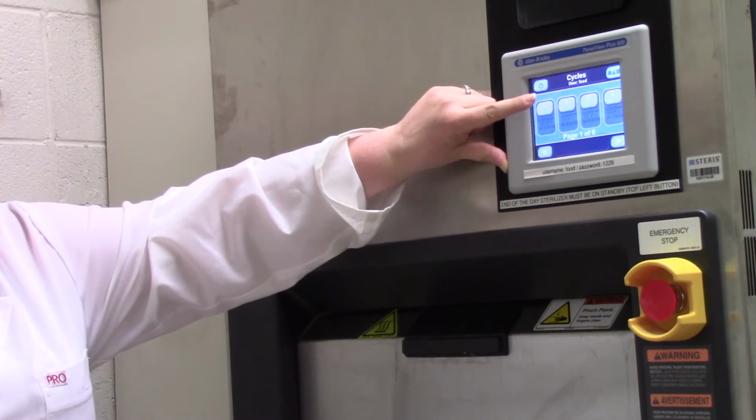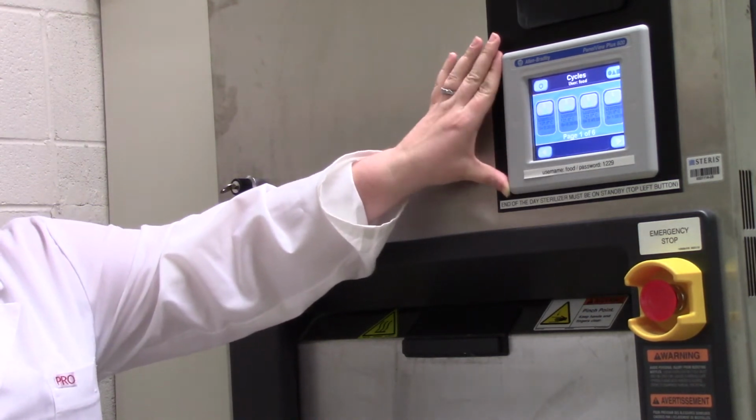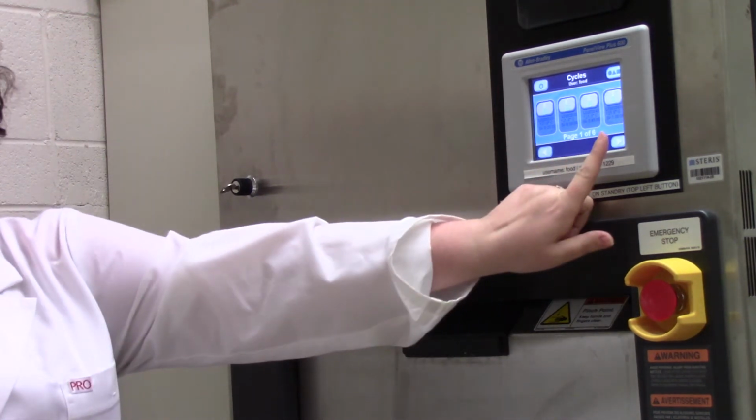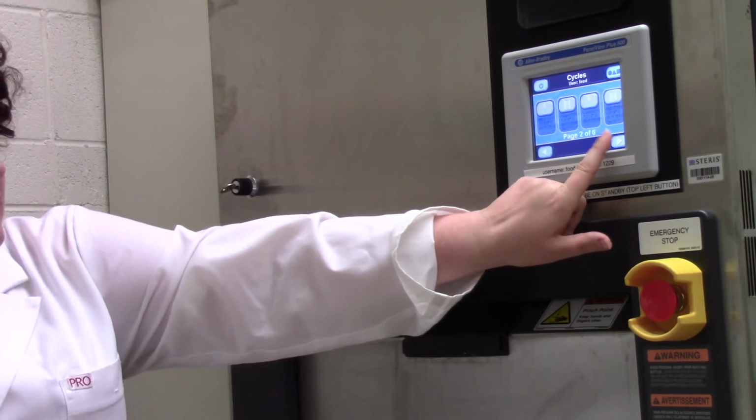So there are other cycles. There's actually 6 pages of cycles. So every so often you'll be told to use a different setting. And to find those, you can just scroll left to right using the touch screen.